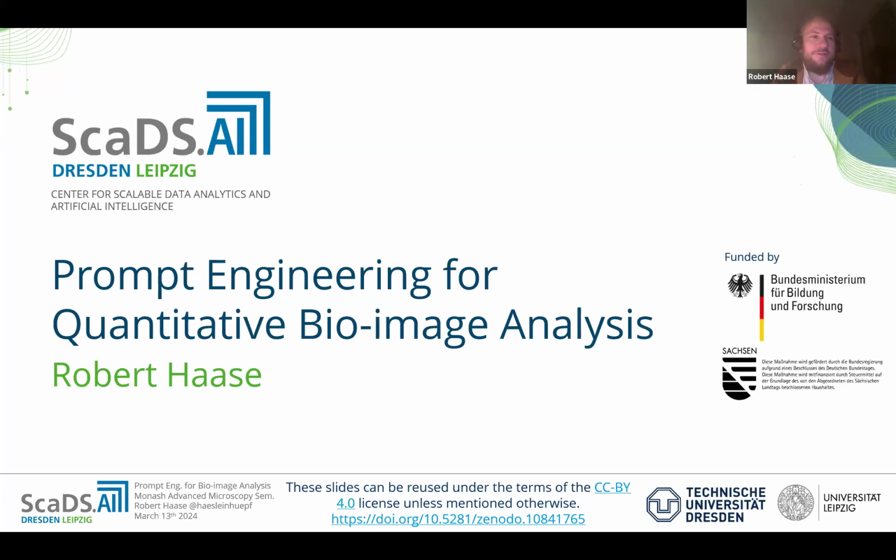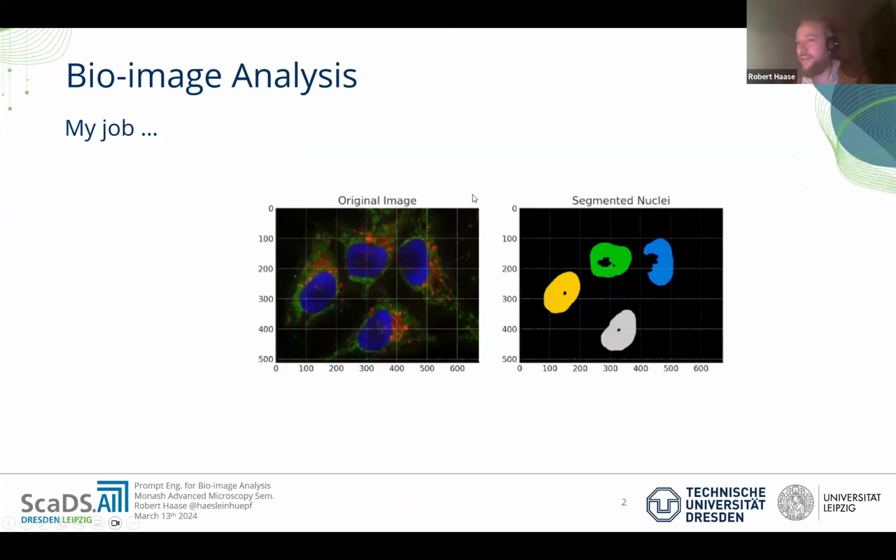My topic today will be prompt engineering for quantitative bioimage analysis. By the way, you can download these slides. The host will share the link in the chat, and then you don't have to take so many notes because you can download that stuff.